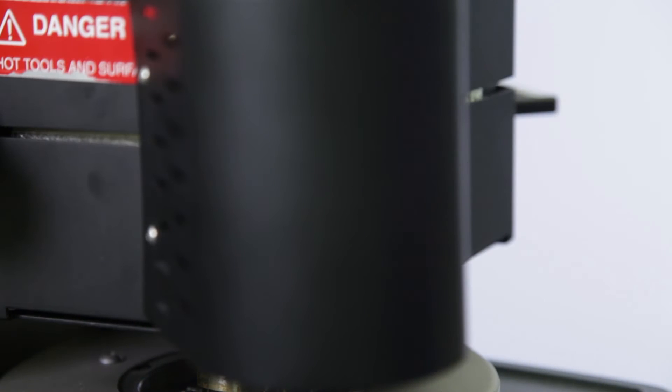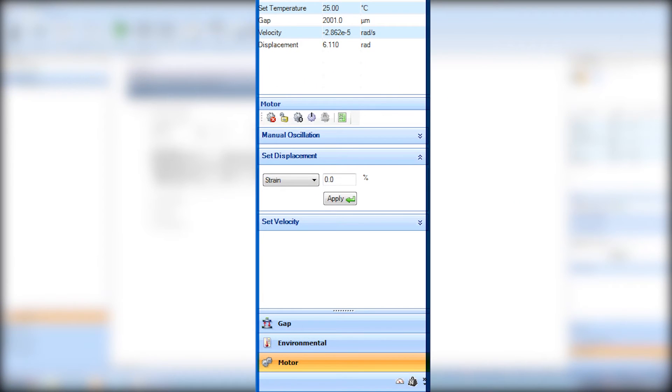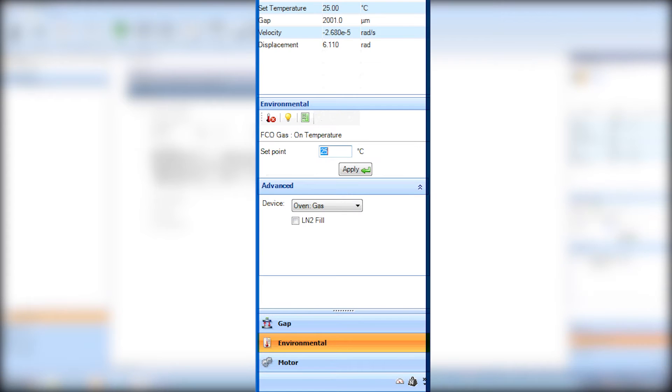Close the FCO and heat to the desired temperature using the appropriate purge gas. Here we will be using gas selection, which will be plumbed with house nitrogen. For best results, allow adequate time for geometry thermal equilibration before zeroing the gap.